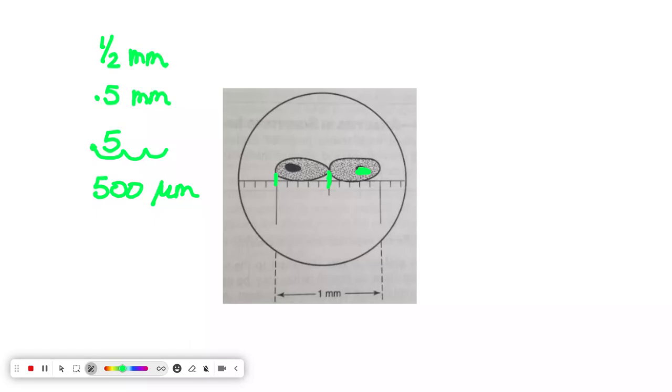But when we ask for the nucleus itself, be careful, which we did previously. So we should know the field of view. You should know how to convert. Make sure you look at it carefully. Okay, that's our video today.